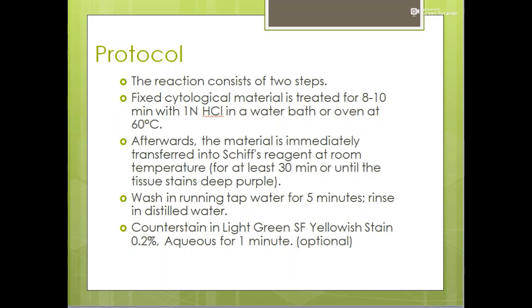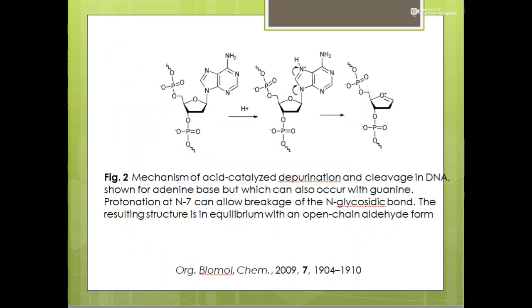This is the protocol. But now, how does Schiff's reagent selectively enable you to stain DNA? Previously we mentioned that Schiff's reagent is being used.